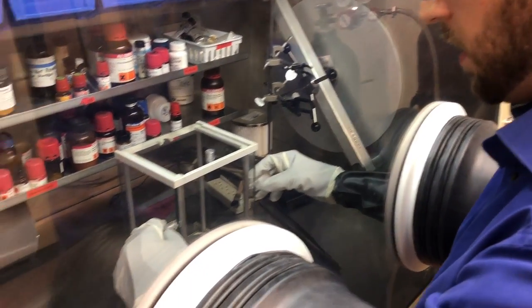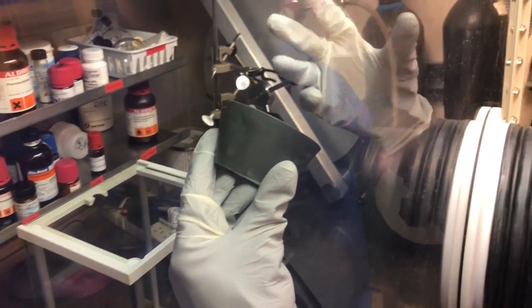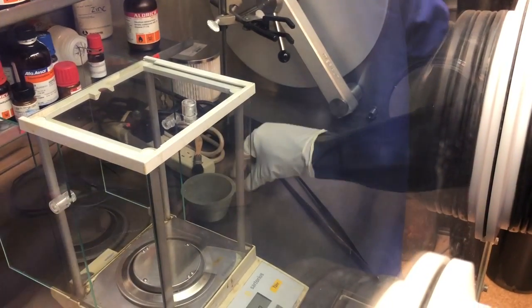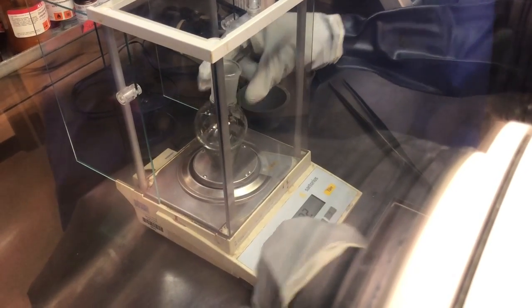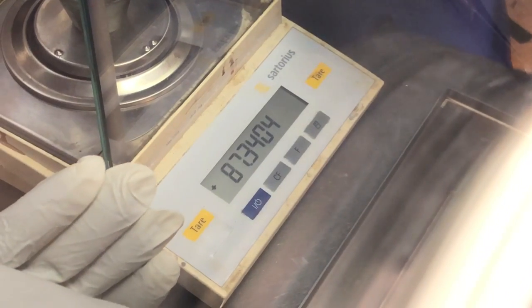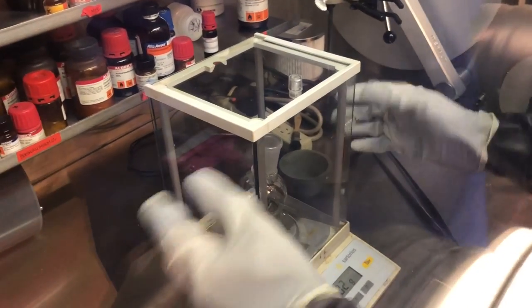Very often you will want to put something on the balance. We don't use cork rings in here because these can carry too much oxygen or moisture. We're not interested in the weight of the flask, just in the weight of the compound. Be mindful that through the circulation in here there's always wind, so we have to close all the doors.